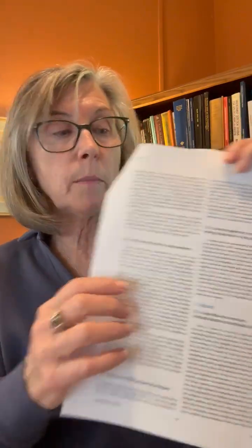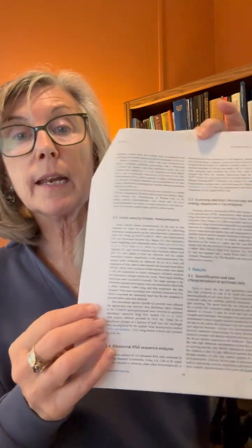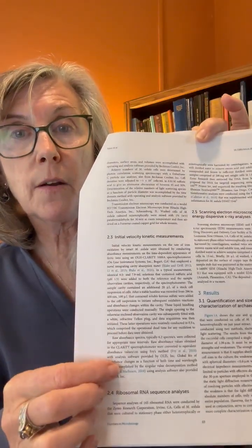Later in the paper, section 2.3, he talks about initial velocity kinetic measurements. That's where he's using the Clarity 1000. He's also using ribosomal RNA sequence analyses and scanning electron microscopy and energy dispersive X-ray analysis as the additional methods for confirming what it is that he concludes.